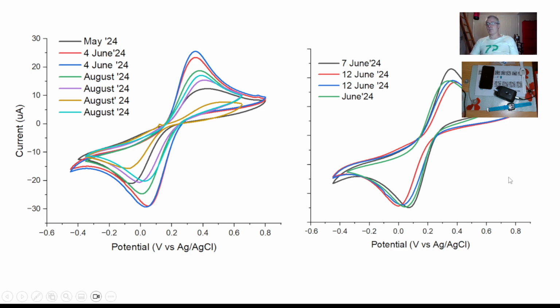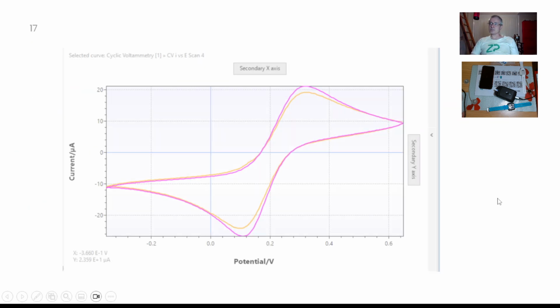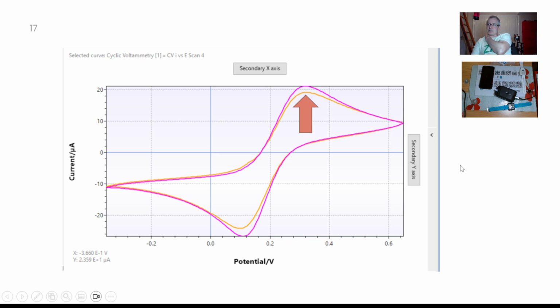So it's interesting because people will approach us with a problem, but the problem actually seems to be that it's not so much reproducibility. What they're trying to do, I suspect, is form a layer of biological material upon this electrode. They take an electrode, and the electrode has a good cyclic voltammogram. They're probably investigating it with essentially ferricyanide. Then they try to put a coating on that gold surface, and actually the electrode looks really just the same. If anything, it looks a little bit cleaner. So they haven't exactly coated it. They've actually just ended up cleaning the electrode or changing the electrode surface, maybe roughening it up a bit.